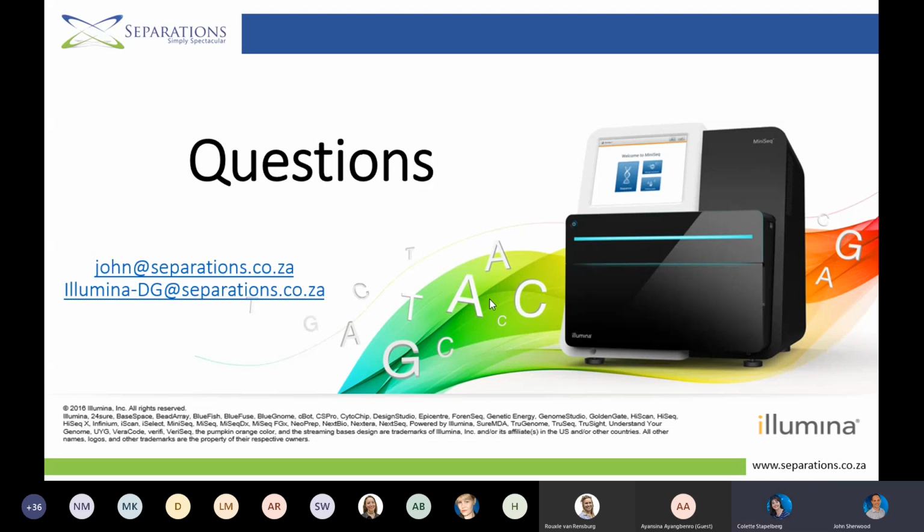Guys, I thank you all, but we do have one more question that's just come in. How well does the MiniSeq handle regions of high polynucleotide repeats? That's a very good question. Christian, to answer your question, one thing that's very important to note with a lot of the Illumina-based systems is that if you want to look at something that has high repeats, or even low nucleotide variation over samples, that is possible. Generally speaking, with something like a telomeric read or very long repeats, you want to increase your read length as much as possible, so that you span those regions and make alignments a little bit easier.